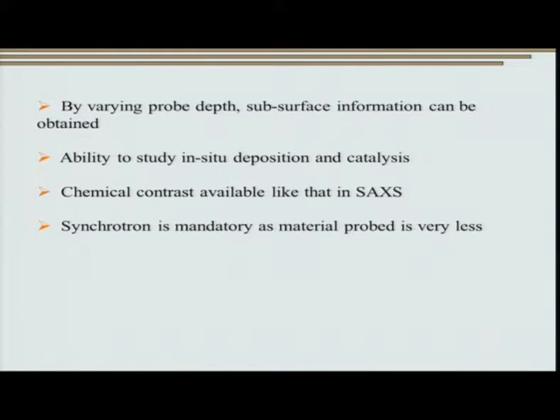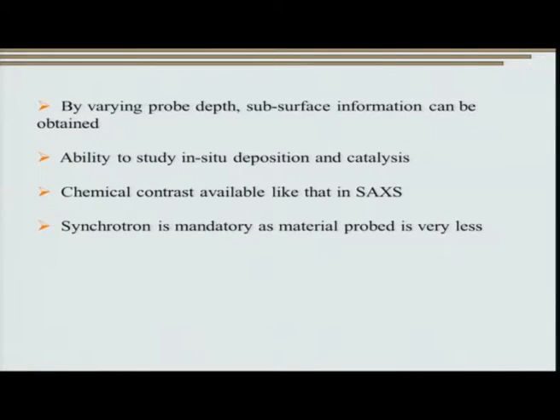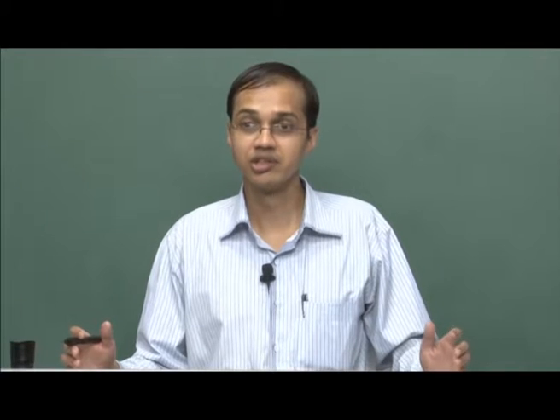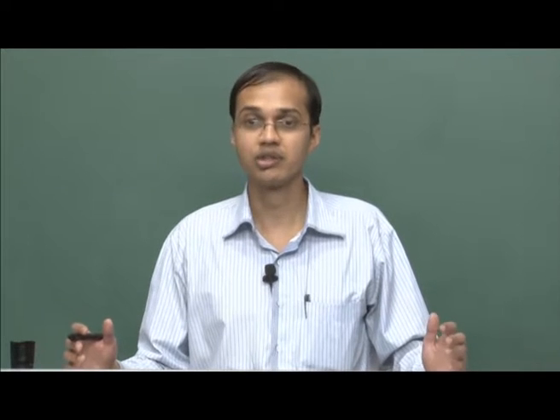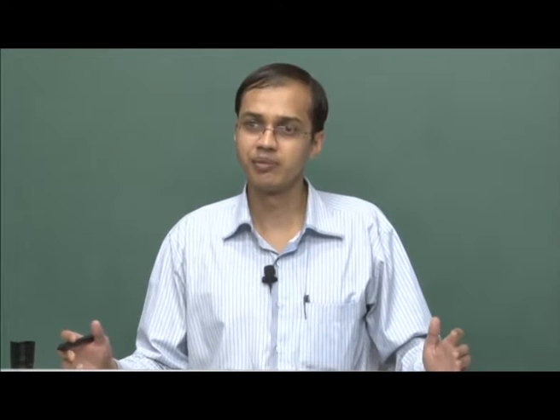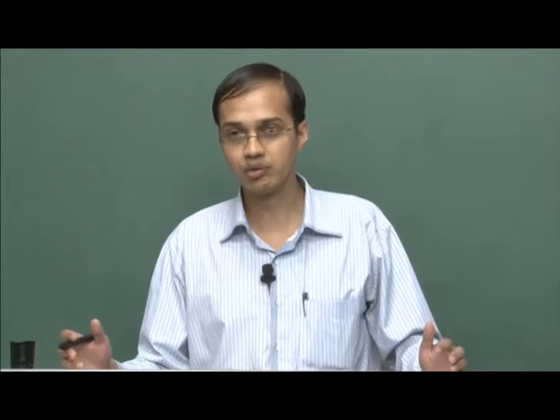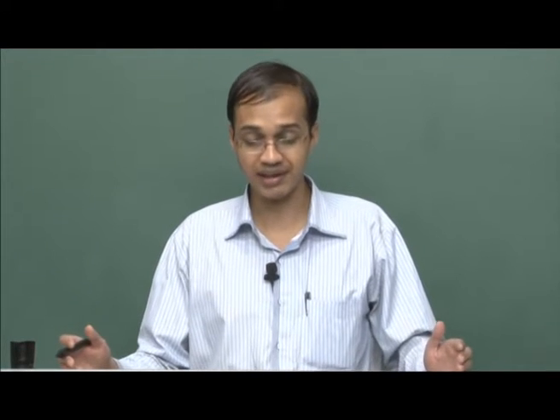The best part about GISAXS is that simply by varying the probe depth, the depth to which the X-rays are penetrating, we can obtain significantly important subsurface information using GISAXS. This is particularly important for studying subsurface damage caused during, say, something like implantation. The other important aspect, which is peculiar to GISAXS, is the ability to study in situ deposition and catalysis.